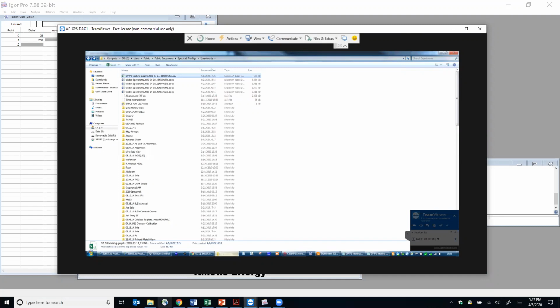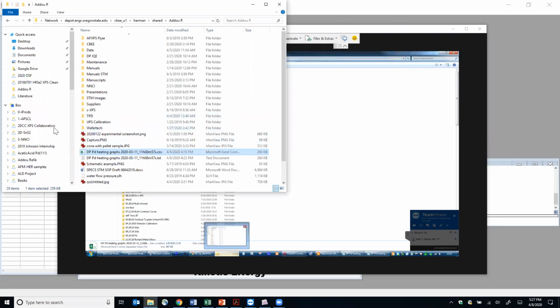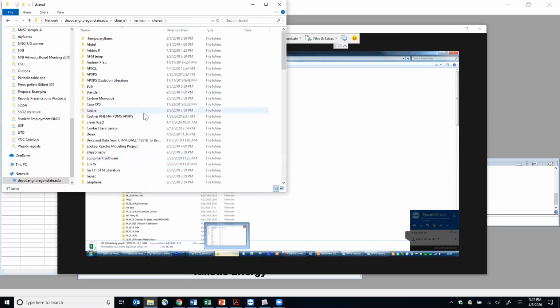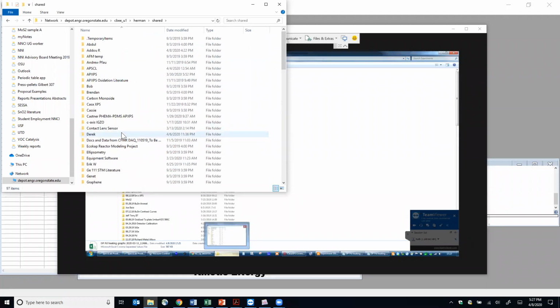Please contact Jordan. He may give you a link or instructions on how to do it. Well, I think I can just figure it out. He just did this for me. This shared shortcut, I click on it. Sometimes it asks me for my OSU ID and password. This is a shared drive that I have access to. Okay.